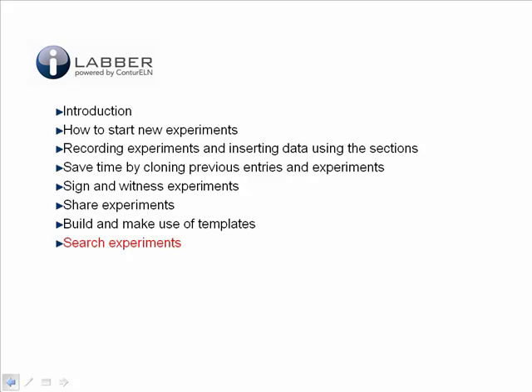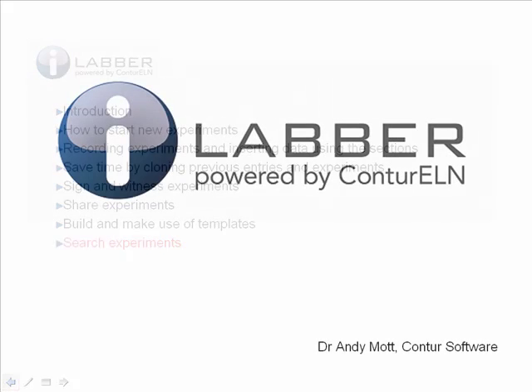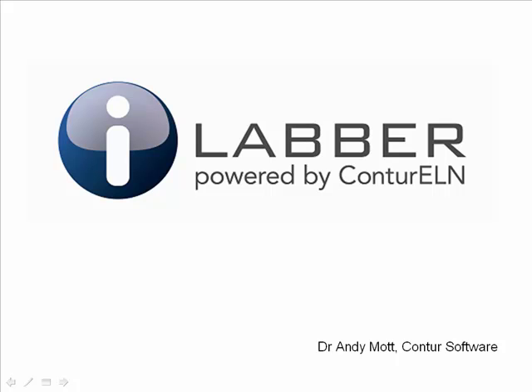So that finishes this introduction to iLabber, and good luck using iLabber.